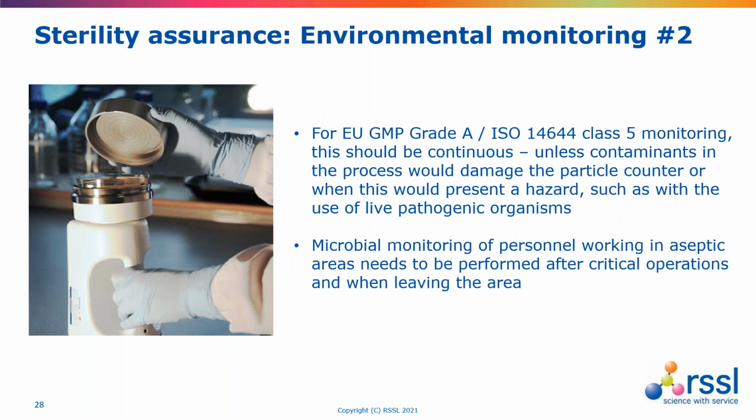Environmental monitoring extends to the necessity to monitor the grade A area continuously, with the only caveats being unless there was something that might damage a particle counter through a high particulate generation, or would present a particular hazard if live pathogenic organisms are being used. Otherwise, the same standard as applied to any other sterile product should be in force.